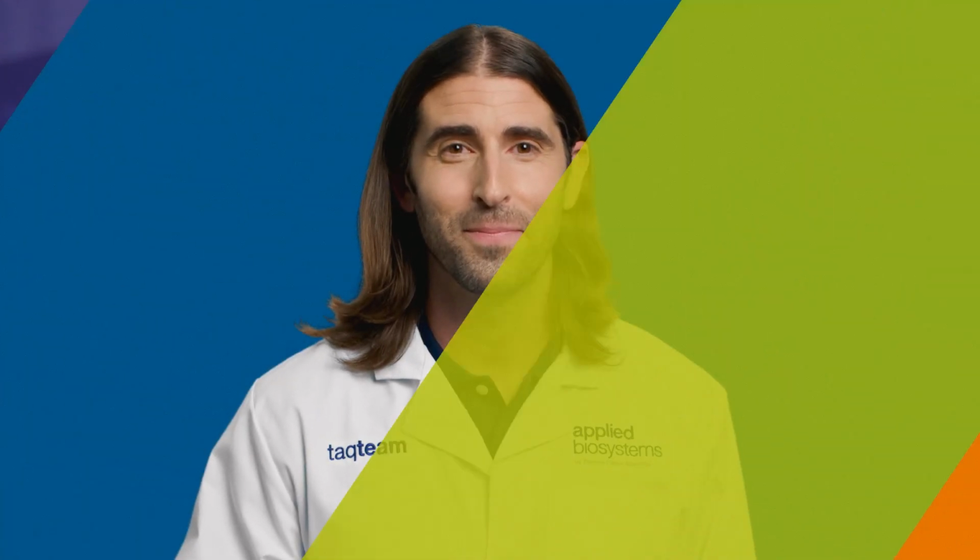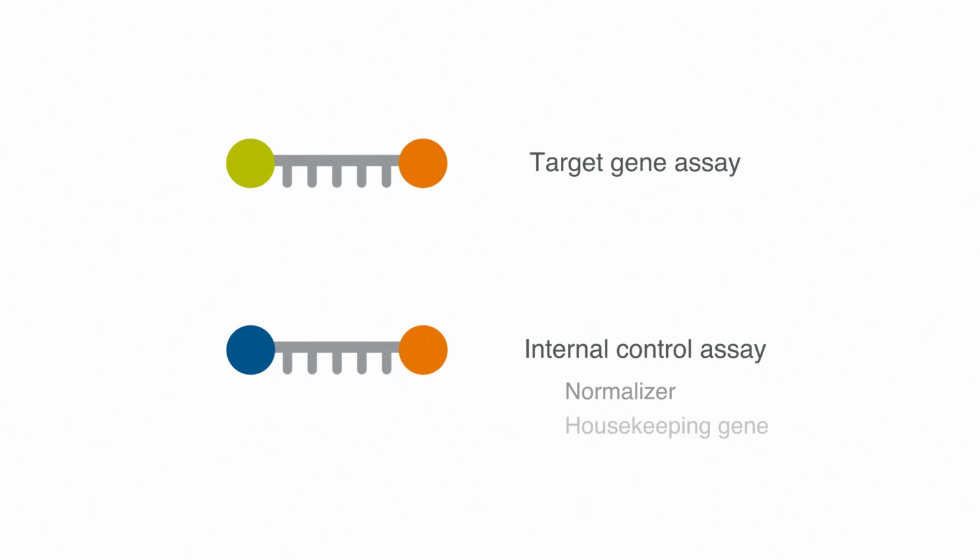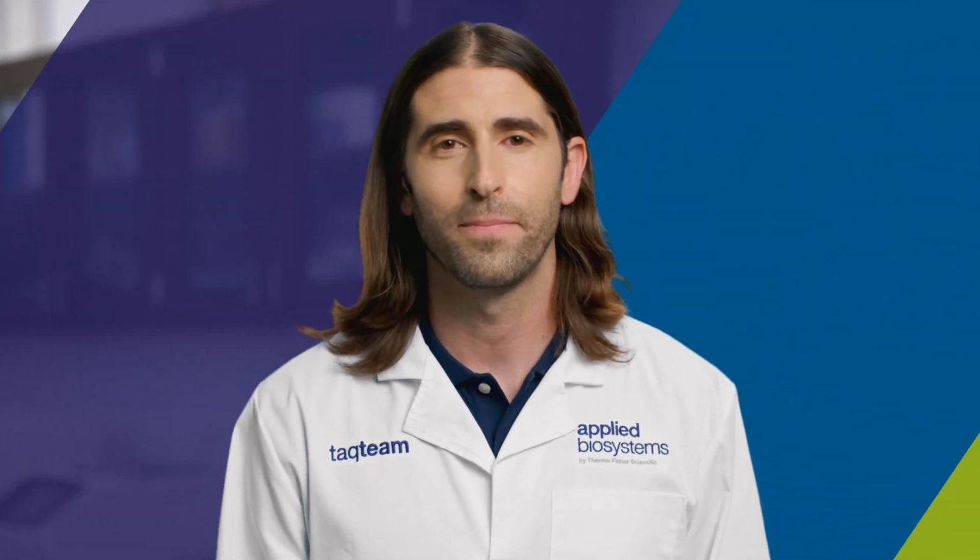Let's talk about it. Whenever we do a gene expression experiment, we need at least two gene-specific assays, one for our gene of interest and one for an endogenous control gene, also referred to as a normalizer or housekeeping gene. Different terms, same idea. So what does the endogenous control do for us? Well, essentially, its number one job is to normalize our data to account for differences in the amount of template added. Here's what I mean.